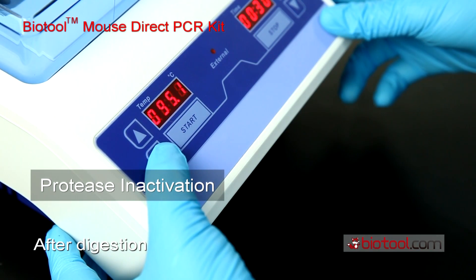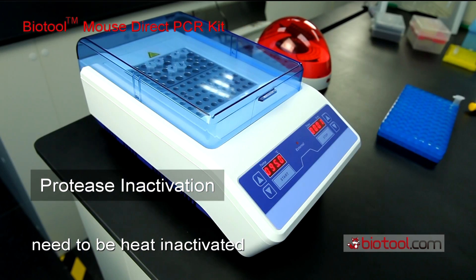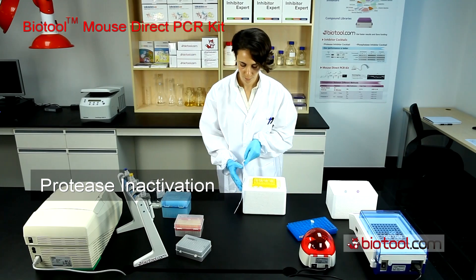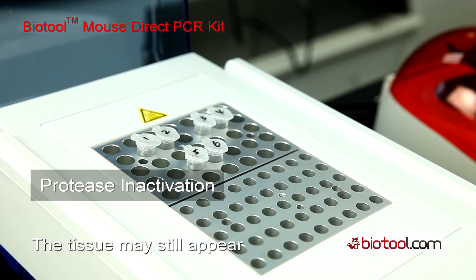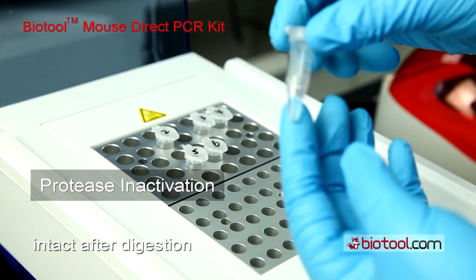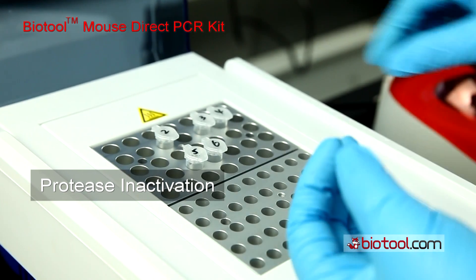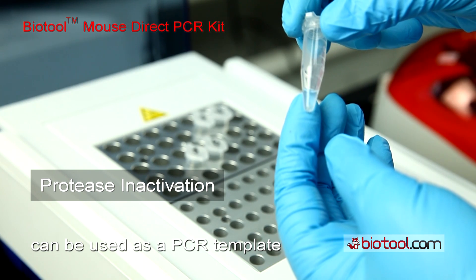After digestion, the protease in the solution needs to be heat inactivated for 5 minutes at 95 degrees Celsius. The tissue may still appear intact after digestion, but extraction has occurred. Now, the tissue lysate can be used as a PCR template.